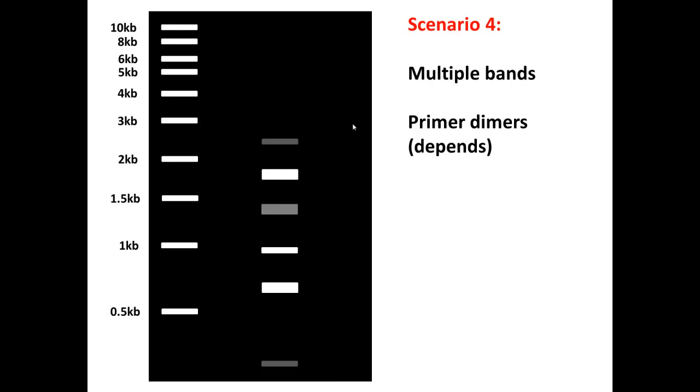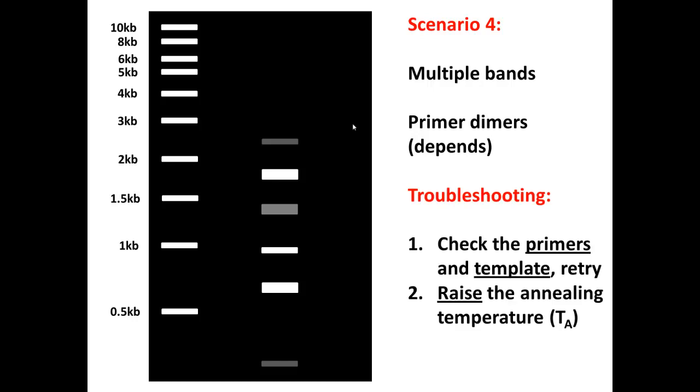Scenario four, we have multiple bands and the usual primer dimers. Again, I said this many times before, but this is very important. Check the primers and templates and you want to retry the experiment if those two things are good. This is another case of non-specific binding. So go ahead and raise the temperature, raise the annealing temperature and see if that solves the issue.